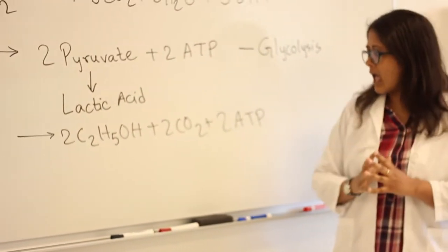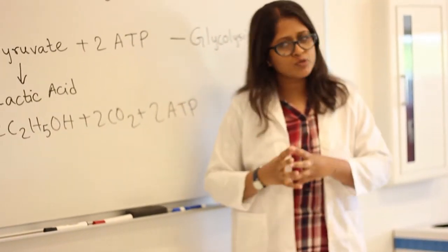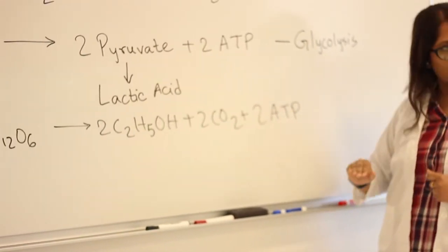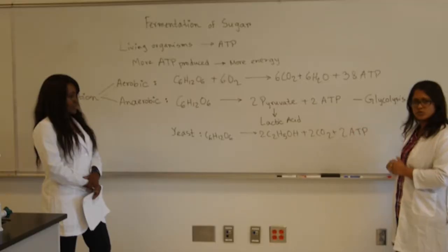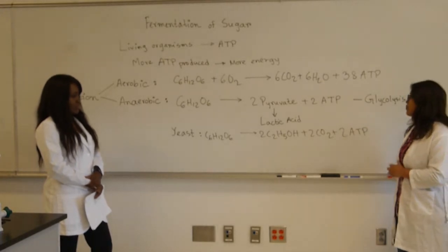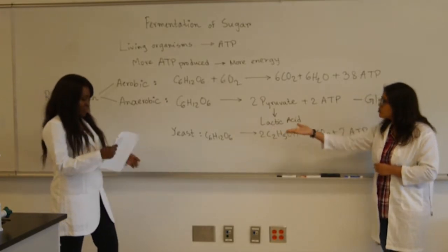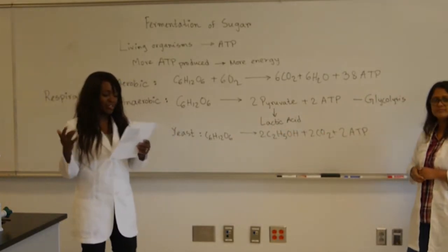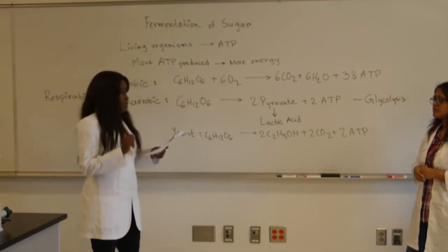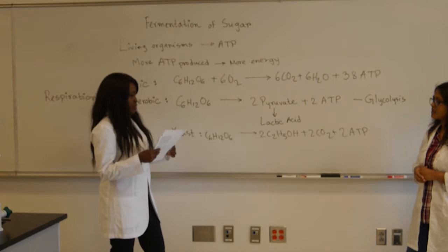In the lab, we don't have a procedure to actually measure how much ATP gets produced, but from the reaction, we see that the mole-to-mole ratio, or how much carbon dioxide gas gets produced, tells us how many ATP molecules get produced. So what we will do is use different types of sugar, like sucrose, lactose, galactose, maltose, even honey and high fructose corn syrup. And we're going to figure out how much ATP is being produced by each sugar.